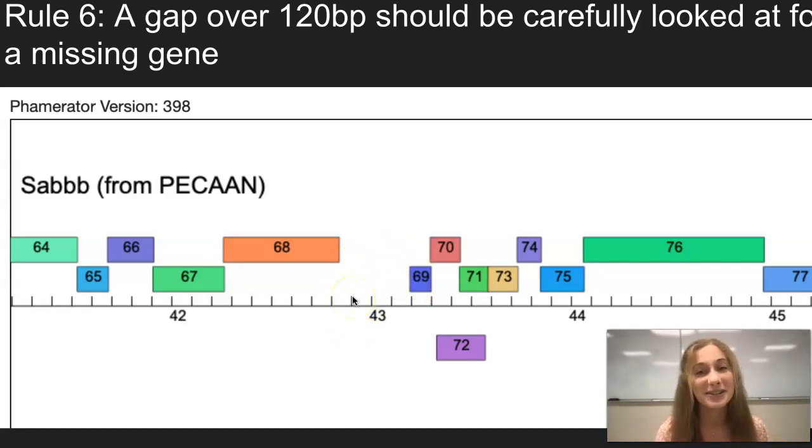So this signifies that when there's a large gap over 120, that you should look back at it because there could be a gene that was not identified by Glimmer or GeneMark.